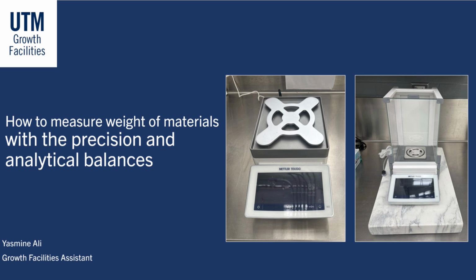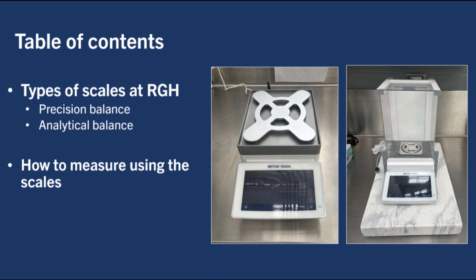I am an undergrad growth facilities assistant at the University of Toronto in Mississauga, and this is the Precision and Analytical Balance instructional video. We will cover two main parts in this video. First, the types of scales at the RGH, and then how to measure and handle.